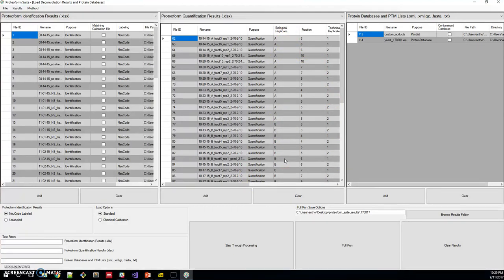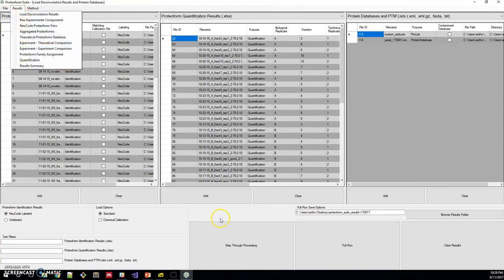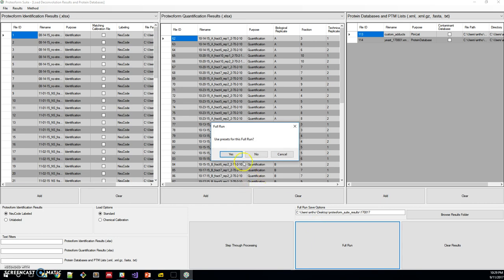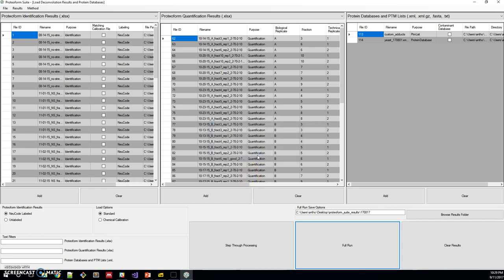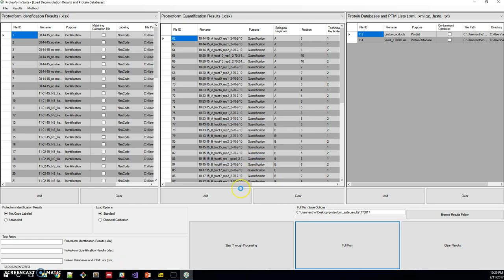Now we can move on to processing. There are two options for processing these results. You can either use the results menu to step through the process, or you can click this full run button. Right now we're just going to click the full run button and I'll go through those results pages after it's done. We already loaded presets, I'm going to click no. And let's not save to this location just yet. Now it's running and it'll take about five minutes. This is an 8-core computer, so it might take less or more depending on what type of computer you have. I'll click pause and we'll come back when it's done.